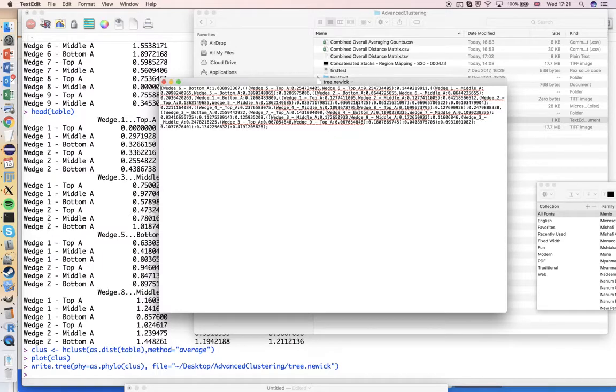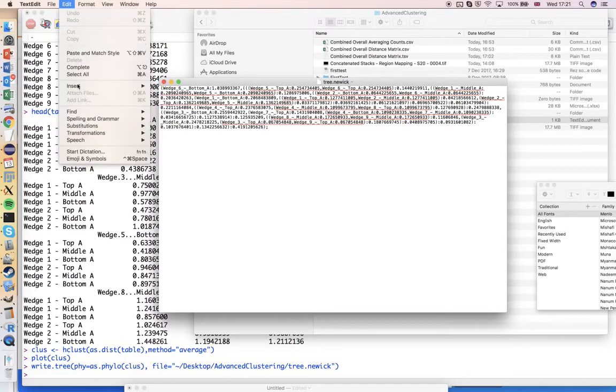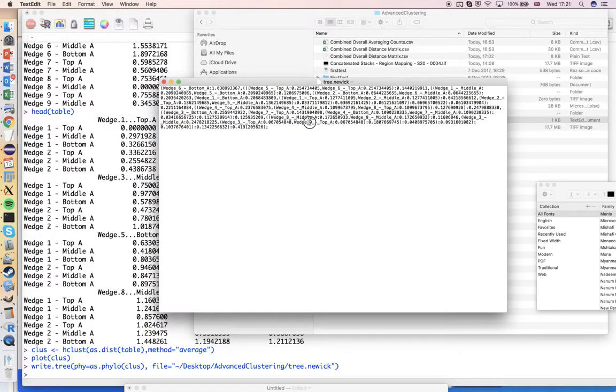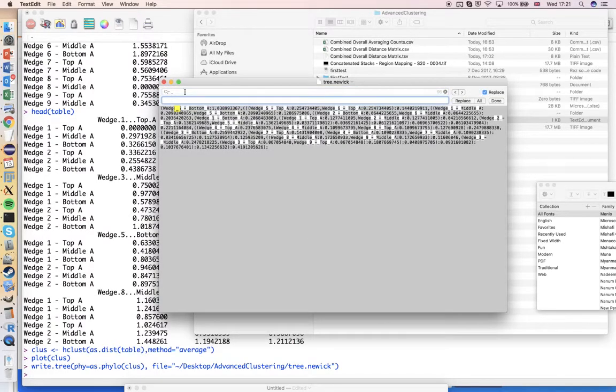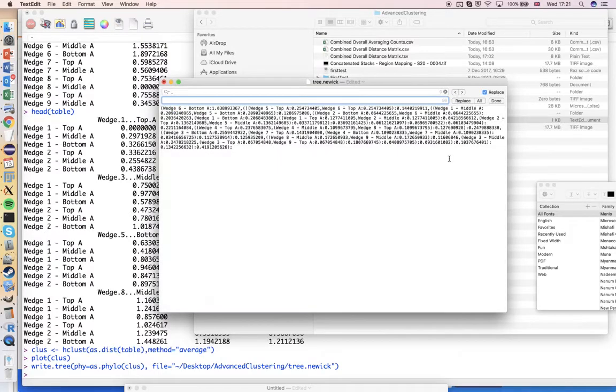Now it's actually done a pretty good job. It hasn't taken the dots, it's taken the column headings, but as you can see, there's a lot of underscores. We don't want those. We'd rather have spaces, and it's fine to just remove them. So I'm just going to do find and replace to change all my underscores into spaces.